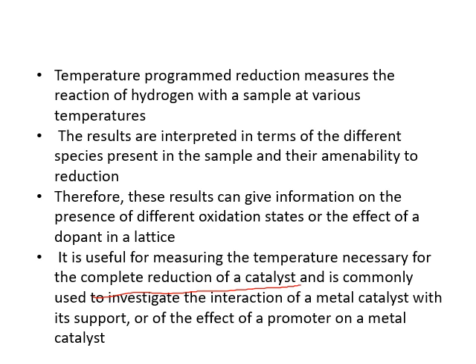TPR is commonly used to investigate the interaction of a metal catalyst with its support. What will be the interaction of the catalyst with the support? Will the metal catalyst react with its support or not? We can measure it: if it reacts with the support, then it will not be reduced easily. If it does not react with the support, the metal catalyst will be free and it will be easily reduced.